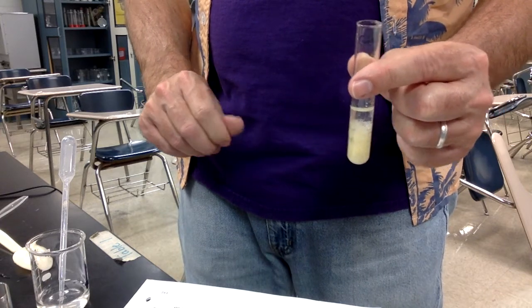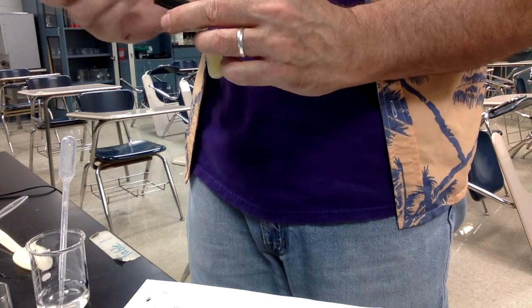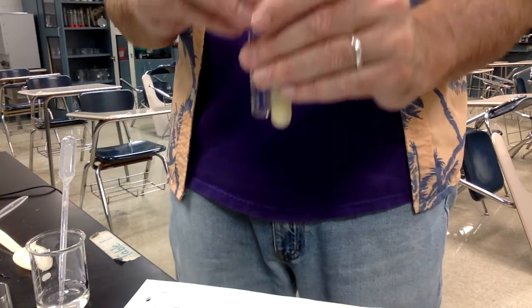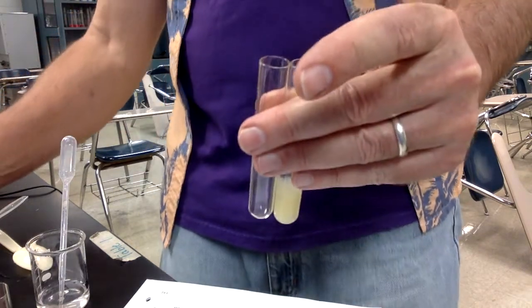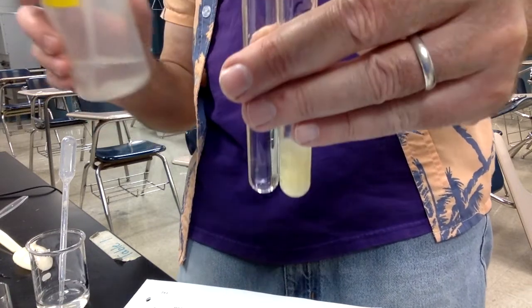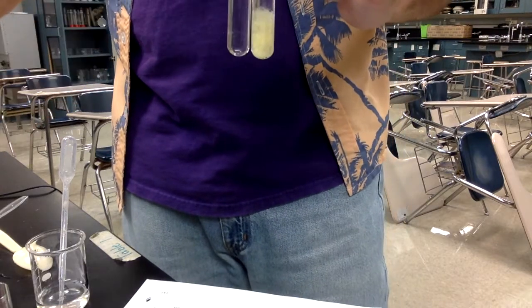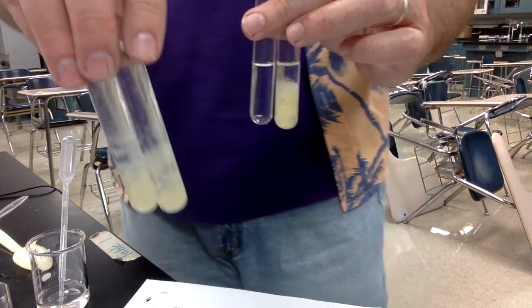Now we're going to centrifuge it again for 5 minutes. So I'm going to need a second test tube opposite this one. And I'm going to fill it with the same amount of liquid so it doesn't upset the centrifuge. And as a bonus, since we're going to be centrifuging 5 more minutes, I'm going to get these two done at the same time.